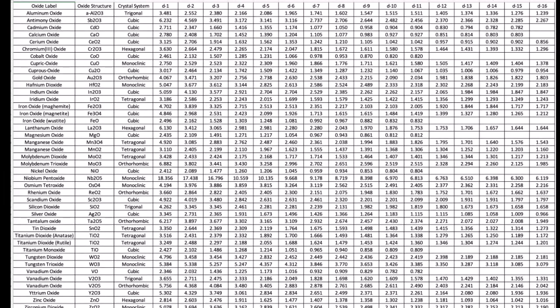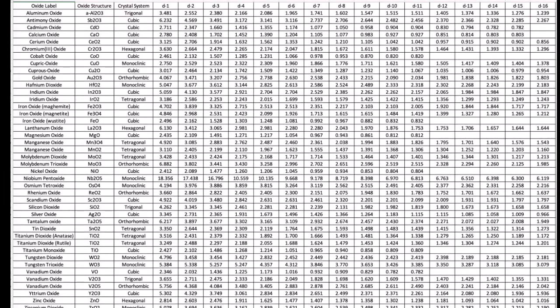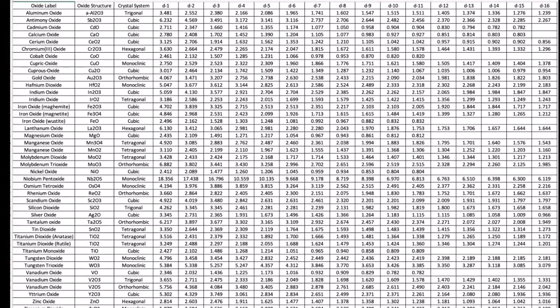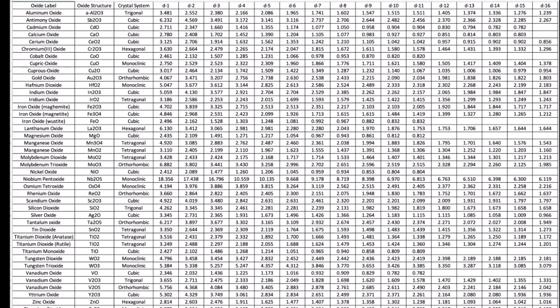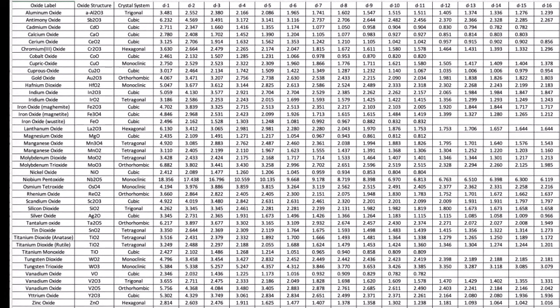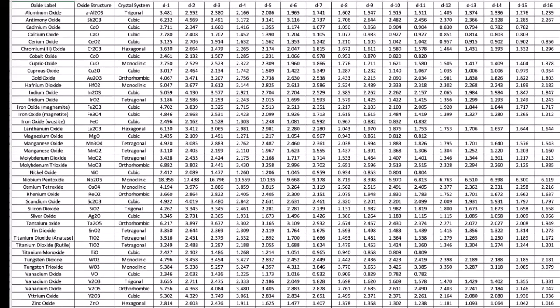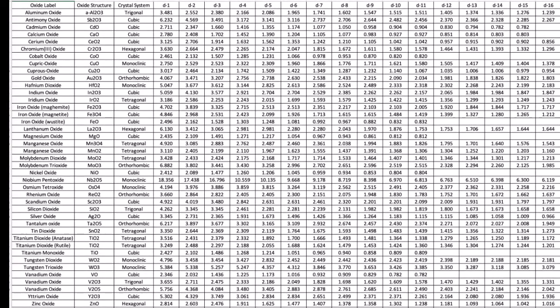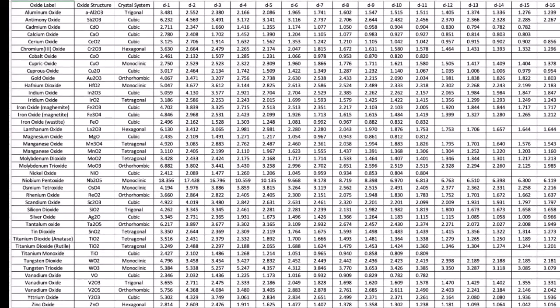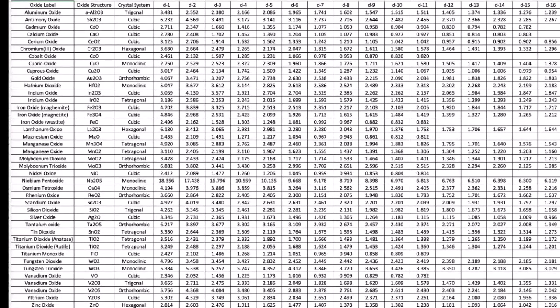Since there will not be an exact match, as no two experiments are ever identical, what I'm expecting you to do is to allow for some small variation or difference between the measured pattern and the data in the database, and determine which sample in the database most closely matches the d-spacings for your sample.